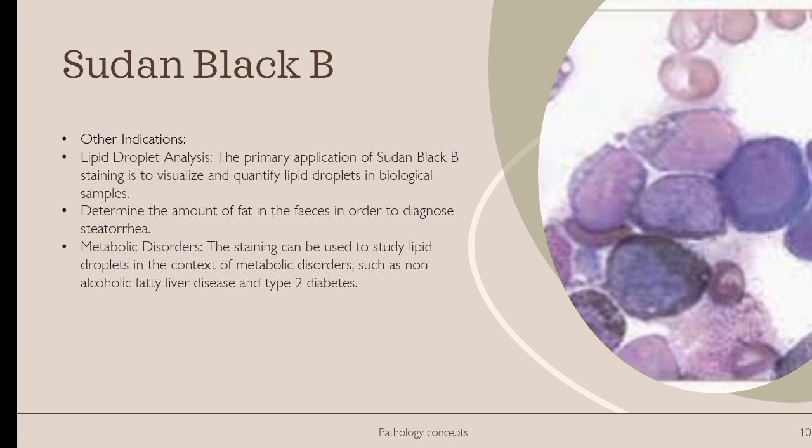Other indications of Sudan Black B is lipid droplet analysis. The primary application of SBB staining is to visualize and quantify lipid droplets in biological samples.